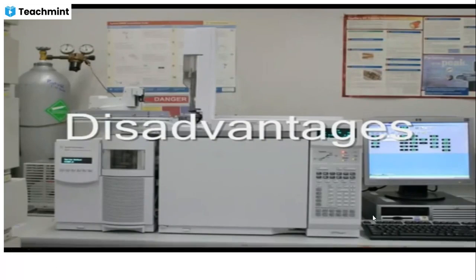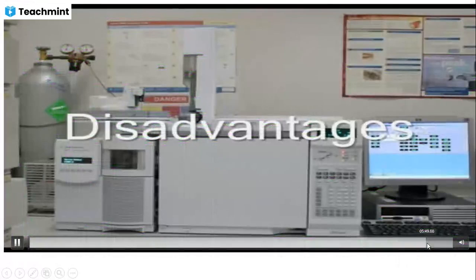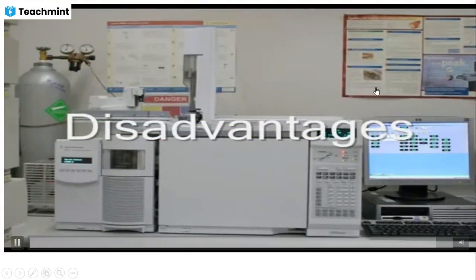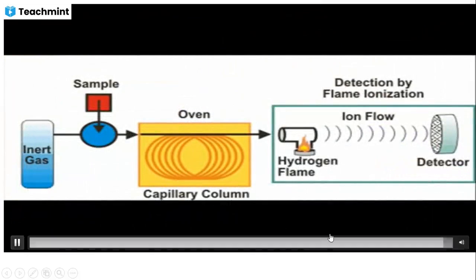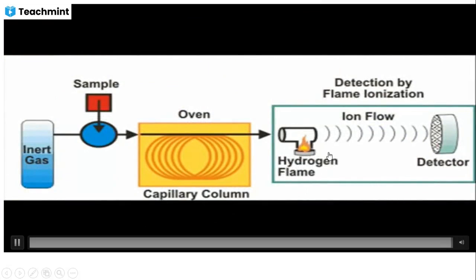hydrogen gas, helium, nitrogen gas, oxygen, carbon monoxide, carbon dioxide, water, ammonia, nitric oxide, and hydrogen sulfide. Although these disadvantages exist, the flame ionization detector is still one of the best detection methods in gas chromatography.